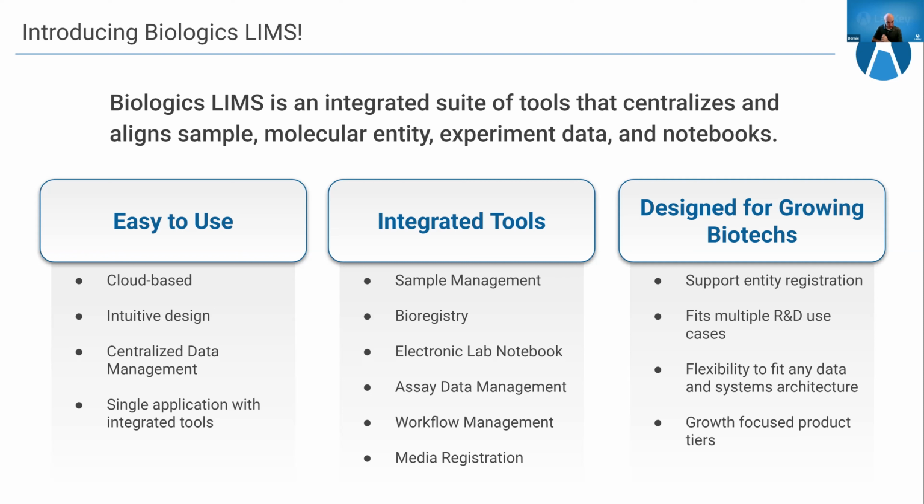Our Biologics LIMS is, as the name implies, oriented around biologics development. It starts with recognizable data structures and entity relationships common to the industry, such as nucleotide sequences, vectors, constructs, molecules, etc., but leaves you the ability to both update those data structures and add your own. Each of these registry structures relates to the samples that flow through your teams, enabling propagation of critical information as those materials progress through your pipeline.